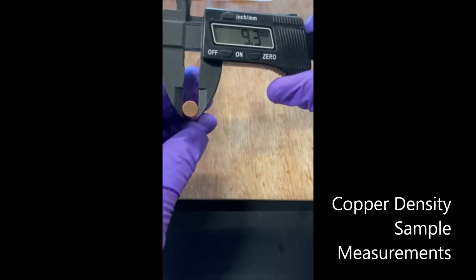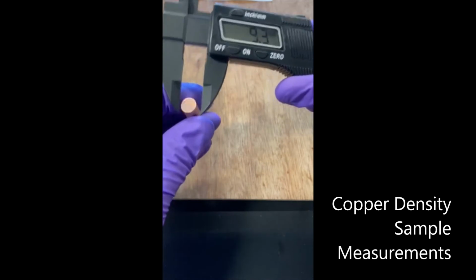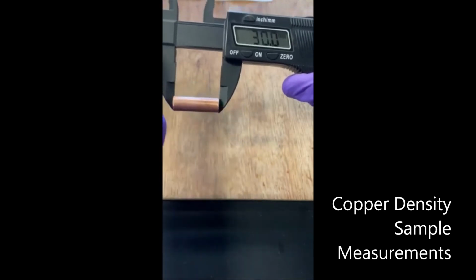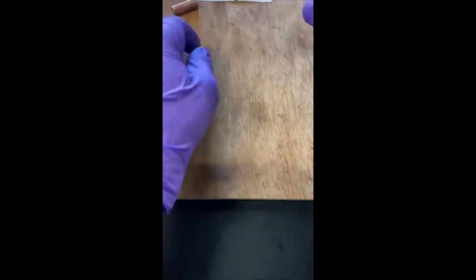Again, the sample is a right regular cylinder, so we measure the diameter of the cylinder. We measure at a few locations, and it's very close to 9.3 millimeters everywhere. Then we're going to measure the length of the cylinder, which is approximately 30 millimeters long.